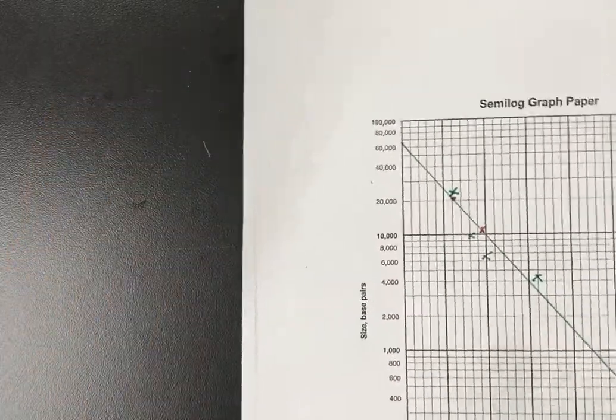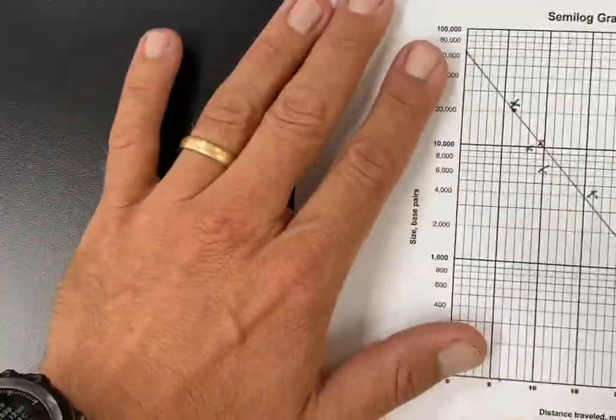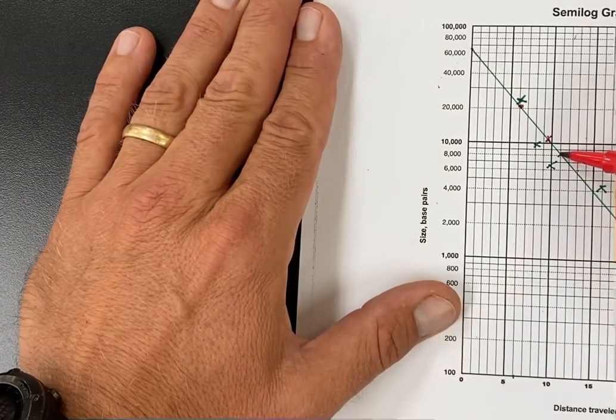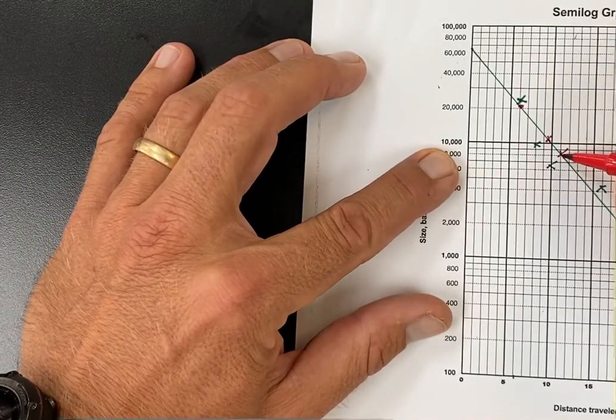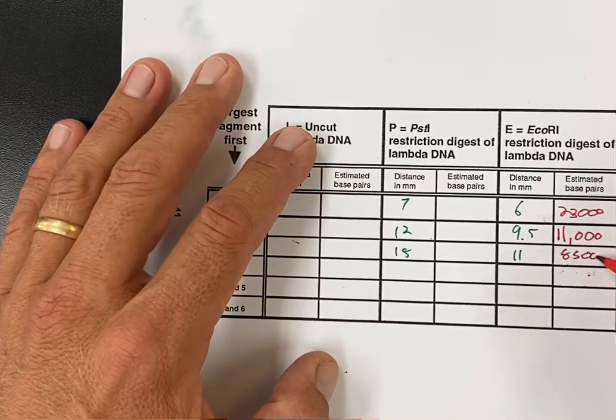And then my last one, I already forgot what that said. That said eleven millimeters, so I'm going to go eleven and that hits right here, which looks like it's about eight thousand, maybe eight thousand five hundred base pairs. And so that gives me an indication of about how big those bands are.